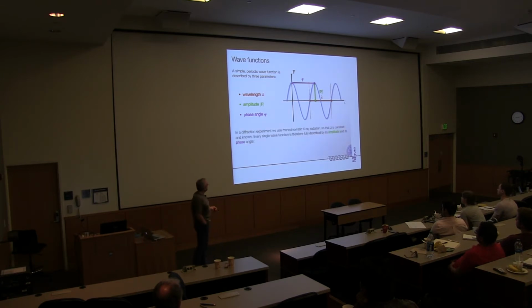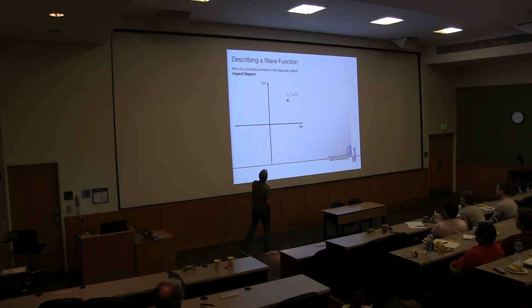So technically, we really have a very simple formula for each one of these waves that we need to add up, that we need to Fourier transform. And in some way, our little black dots, that's all we measured, the intensity of these little black dots must represent this. Okay, now how does that work? Well, this is something that you saw already from Nikolai yesterday. We're representing our waves as complex numbers. How are we doing that?